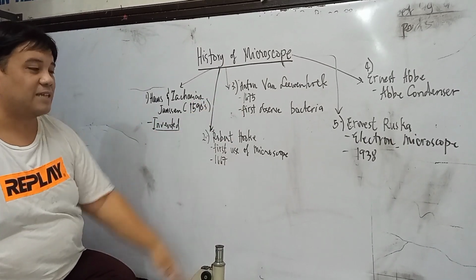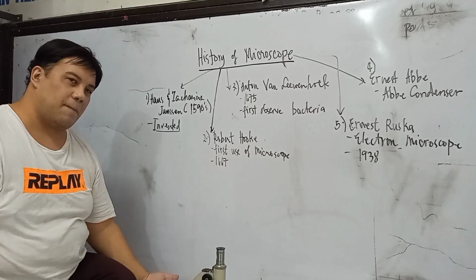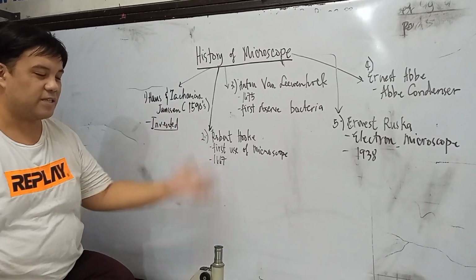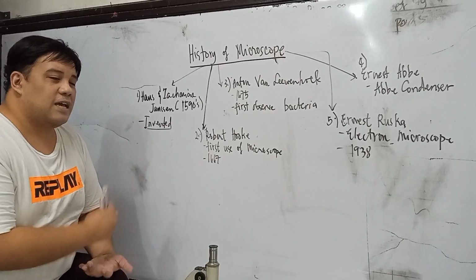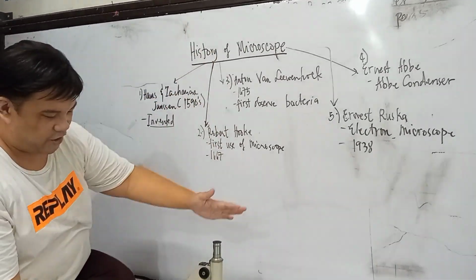After ni Ernest Ruska, dire-diretso na yan. Nagkaroon na ng iba't ibang dimension ng microscope, iba't ibang parts and functions na medyo level up na yung kanyang specifications.